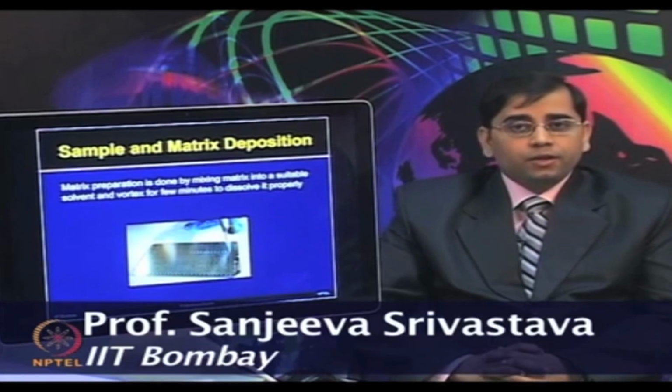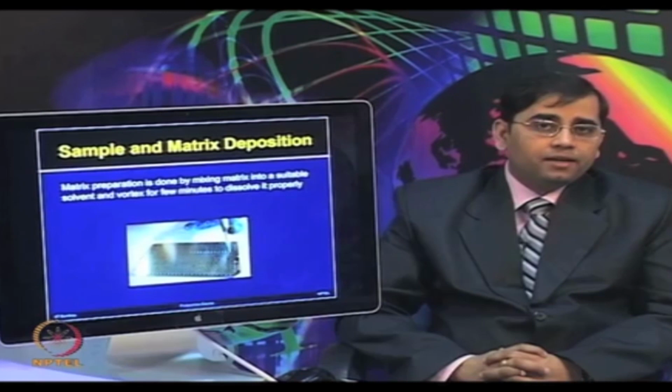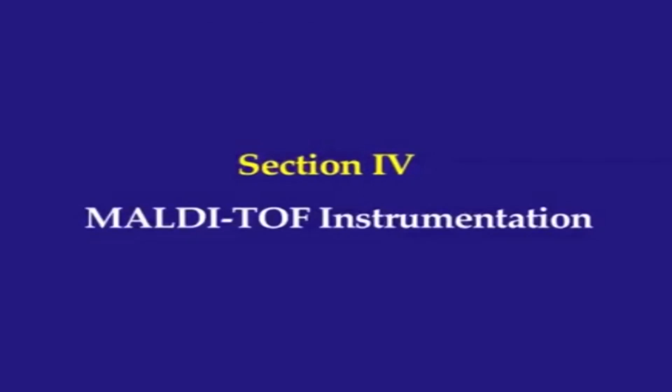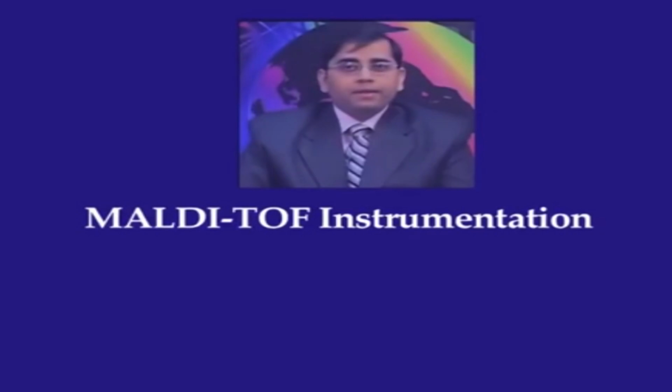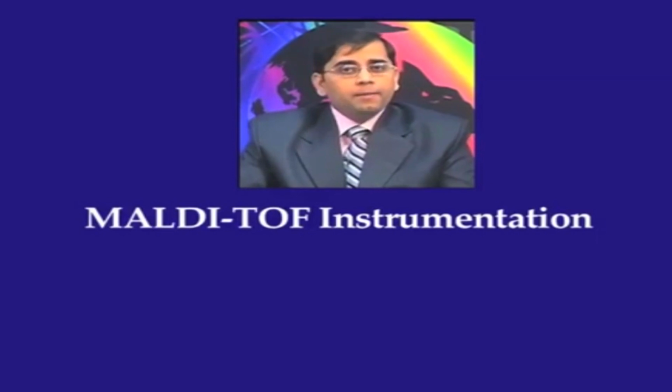And then once you have placed all of the samples of interest on the MALDI plate, you are ready to dry the target plate. Sample spotting is done and the MALDI plate is dried for almost 30 minutes. Then the instrument can be turned on and MS analysis can be performed.